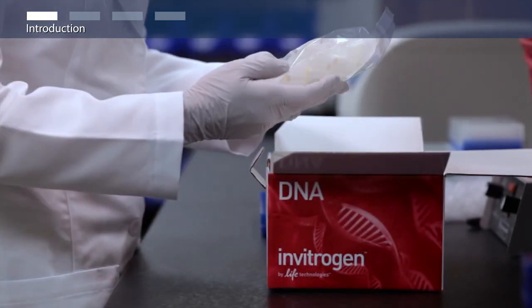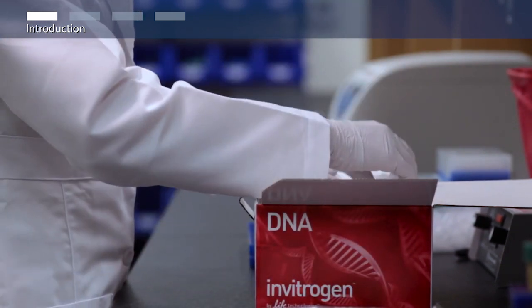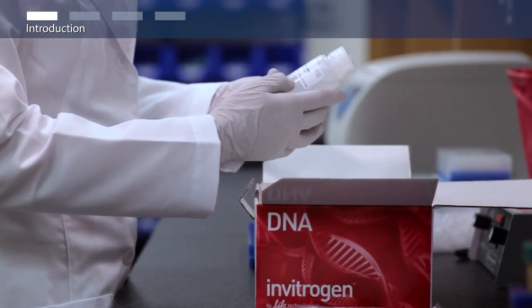This video will provide an outline of stool microbial DNA isolation, plus some tips and tricks. The online manual describes the protocol in detail.